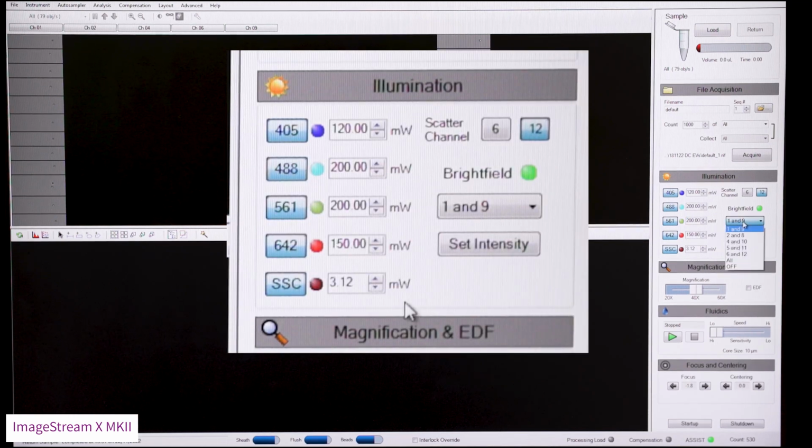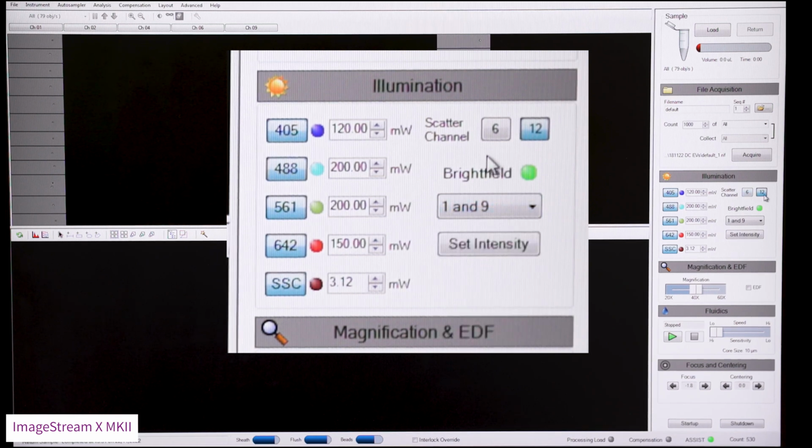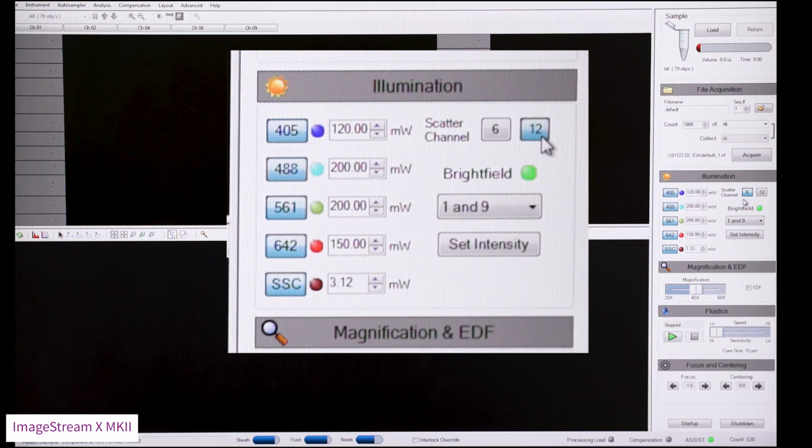The bright field channels are set to channels 1 and 9 by default, and there's rarely a need to change these. All other settings we can consider once we have a sample running. There is a choice to place the side scatter in channel 6, which will prevent the use of fluorophores such as PE-Cy7, or channel 12, which will prevent the use of fluorophores such as APC-Cy7 or near-infrared dyes. You must choose one.